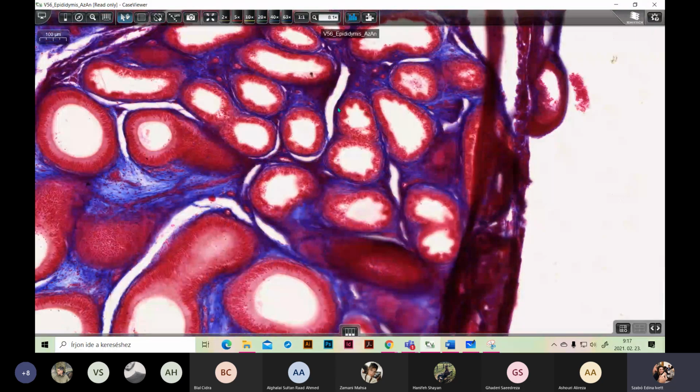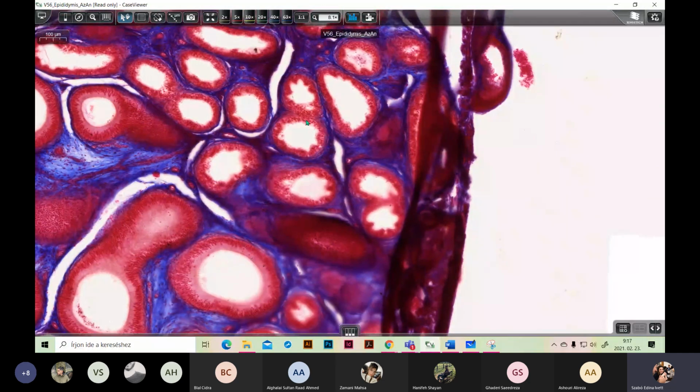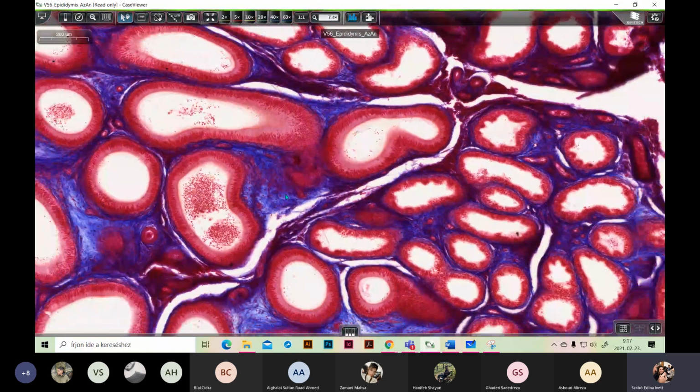And for example here? That's ugly one. And the name of the ugly? Duct of epididymis. The duct of epididymis is the nice one. Efferent. Is an efferent duct of testis. Very good. Okay, efferent duct of testis.